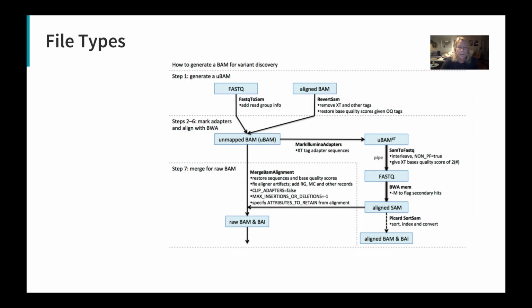This is from the Broad Institute, from one of their processes. And again, this just gets into a little bit more detail. So what the thing here is to generate a BAM file so you can find the variants of interest, the varying letters. And there's 7 steps here.